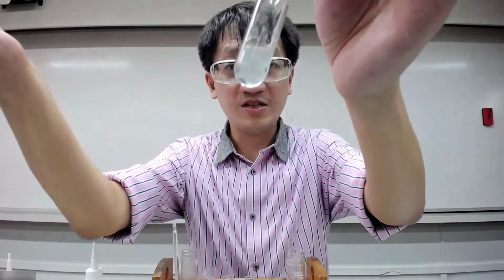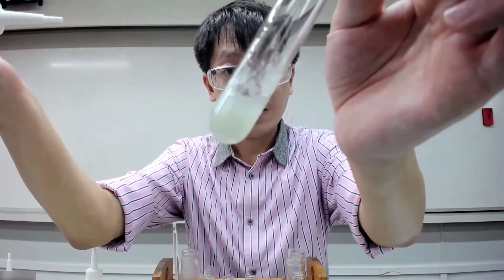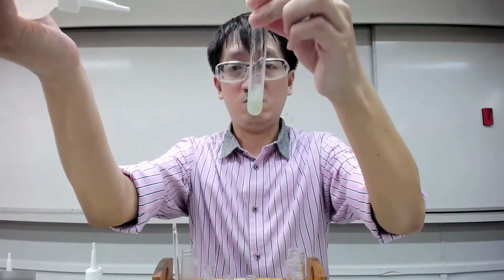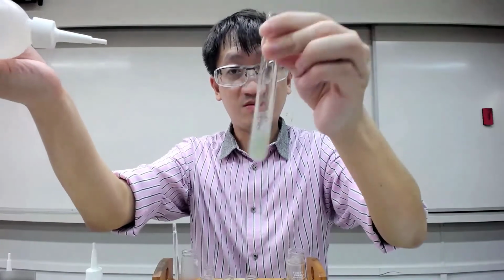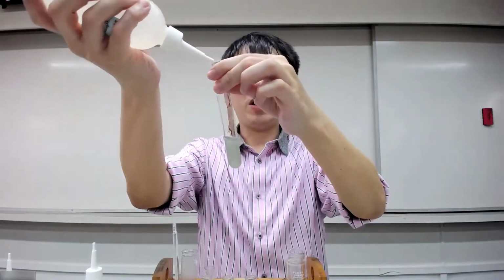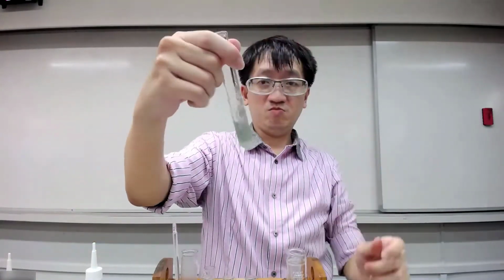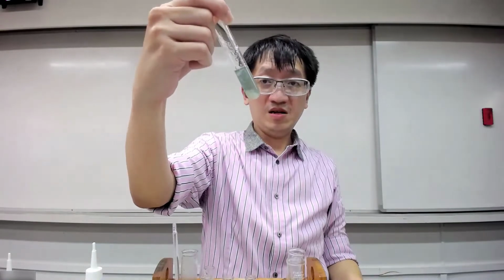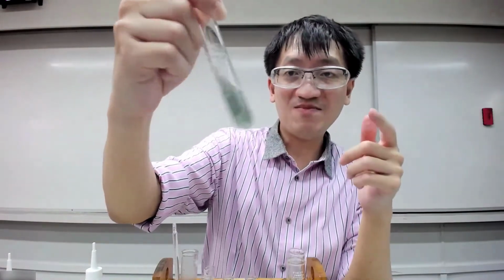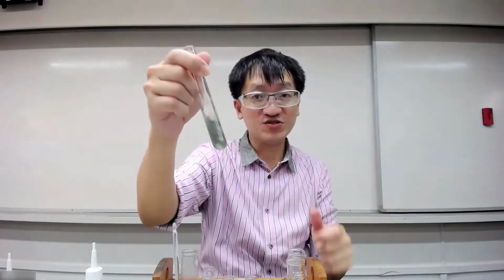Do you notice the formation of the gelatinous, dirty green precipitate? It's quite gelatinous here. I'm going to add more, because it's until no further change. Some of you will be wondering, how come there's a white precipitate as well? So the white precipitate obviously is due to zinc.